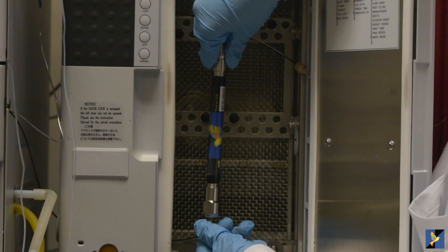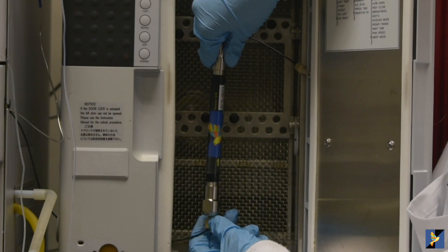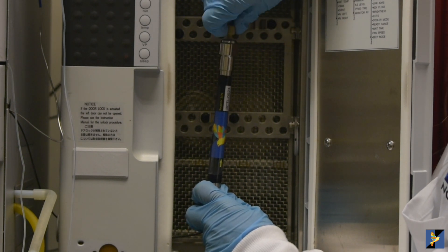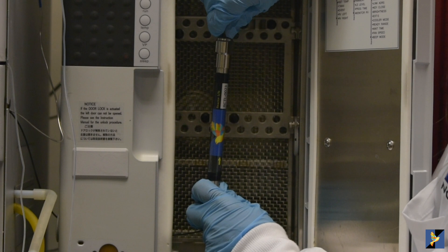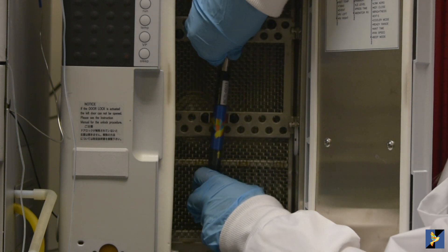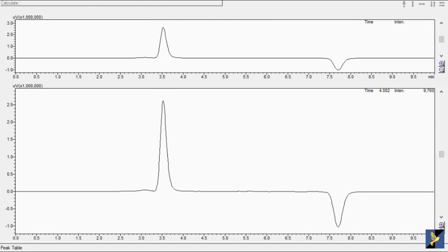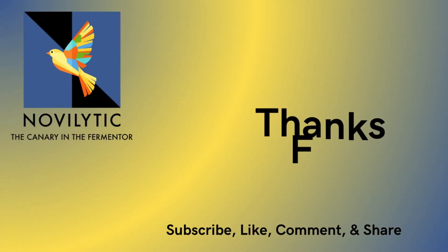Install the mobile phase on your HPLC system. Attach your Proteometer Reactor to your HPLC system. You're ready to go!